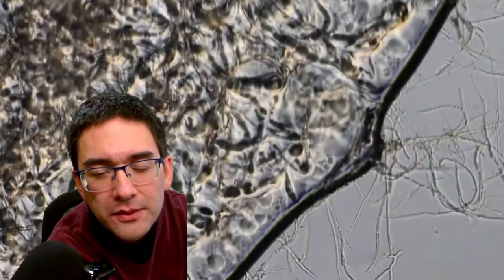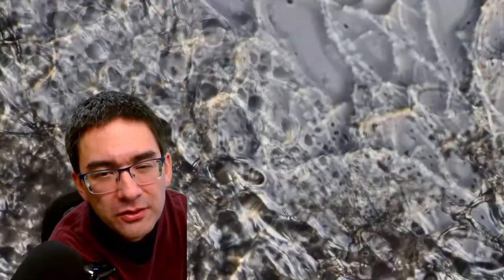Look here. It looks kind of strange because I think there is not enough water in there. So this is basically the edge where the fungus touches the water. So I think it's not a very good specimen because there it's all air in here. So the resolution is not quite nice. These cells here also in the air. These are now in water. So I'm just going to focus on this one.